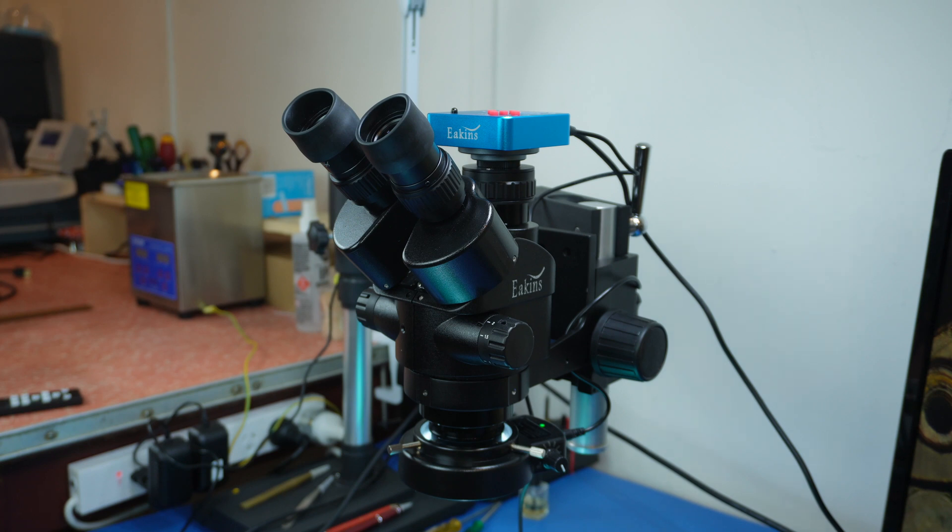Hi everyone, I'm Stephen and welcome to Watch Out. I recently purchased this microscope from AliExpress and the question is: is a microscope from AliExpress any good?